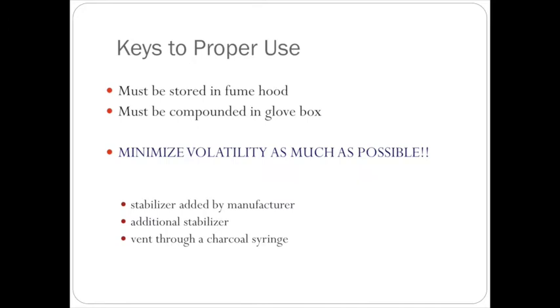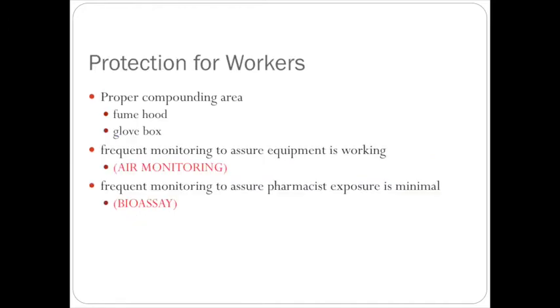But what will happen is it's going to suck the air inside of the vial, the headspace, which is where you're going to have a lot of volatile iodine. It gets sucked into the syringe, the iodine gets stuck in the charcoal, and then we can basically just throw that away. A lot of times you'll see people doing that when they first get a vial of iodine, because there's been a delay between manufacturing and receipt in the pharmacy. And so the assumption is that's probably where you're going to see a lot of your volatility occurring, and the headspace would basically have a lot of volatile iodine in it.